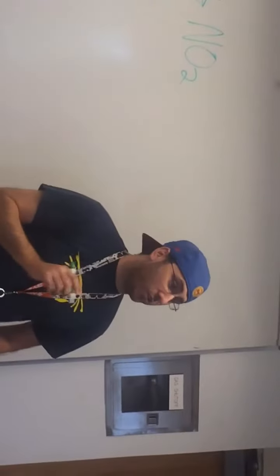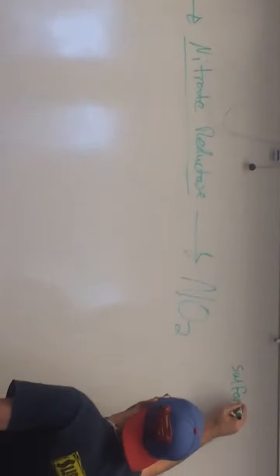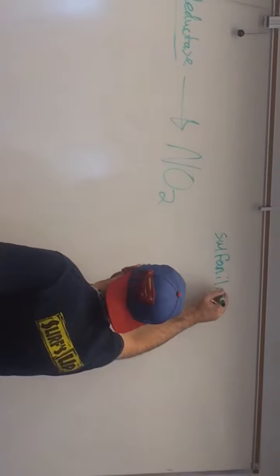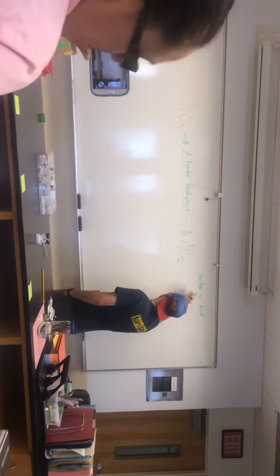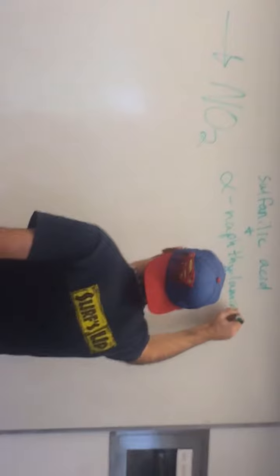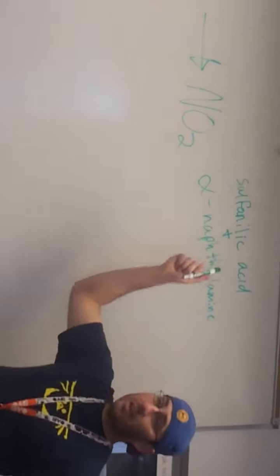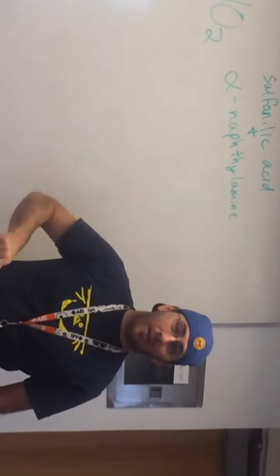Pronounce it right, so you'll spell it right. Sulfanilic acid. Sulfanilic acid and what? Alpha naphthylamine. This is usually a big point where people get mixed up. Bad pronunciation leads to bad spelling.